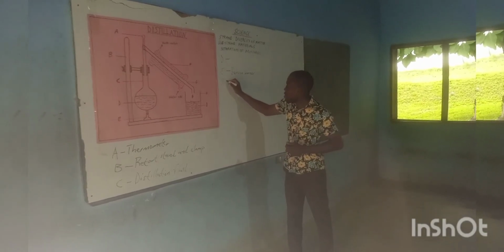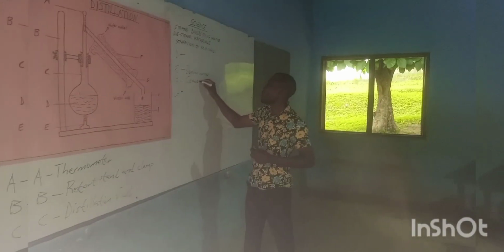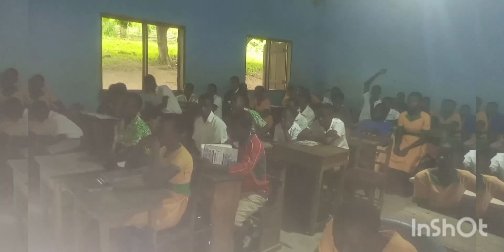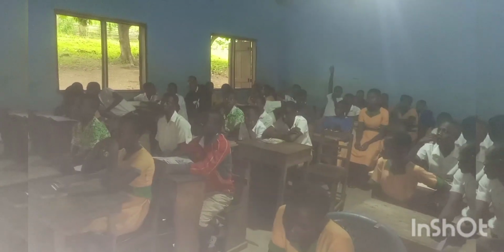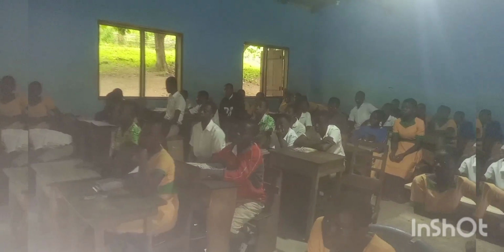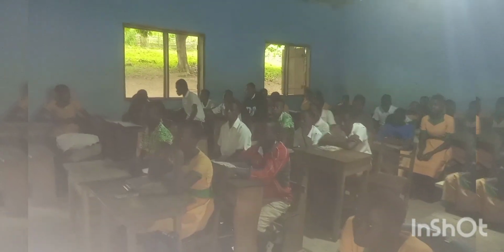Now let's talk about F. F stands for what? Condenser. Come again? Condenser. And G stands for what? Adapter.